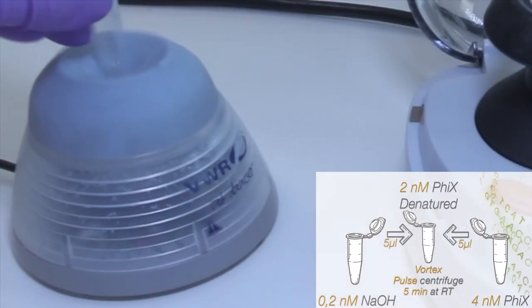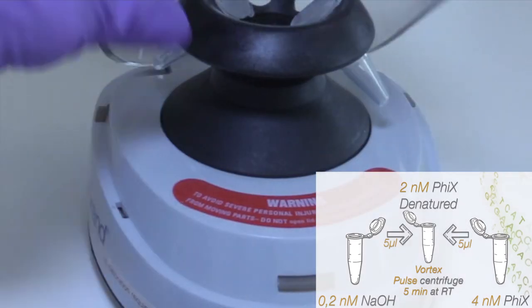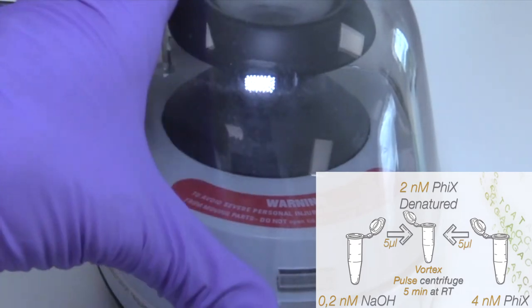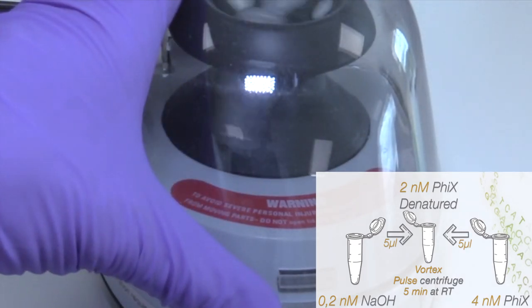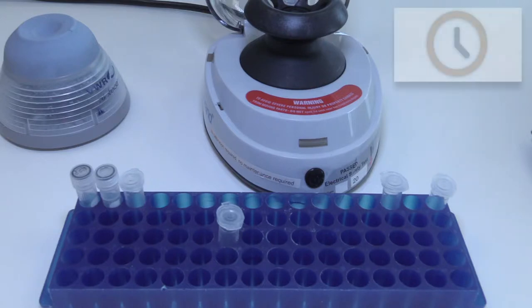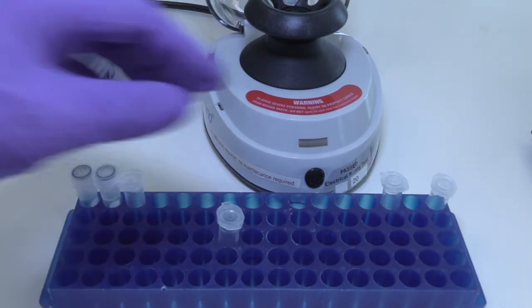Continue by vortexing briefly and then pulse centrifuge the tube. Incubate the microcentrifuge tube at room temperature for five minutes.